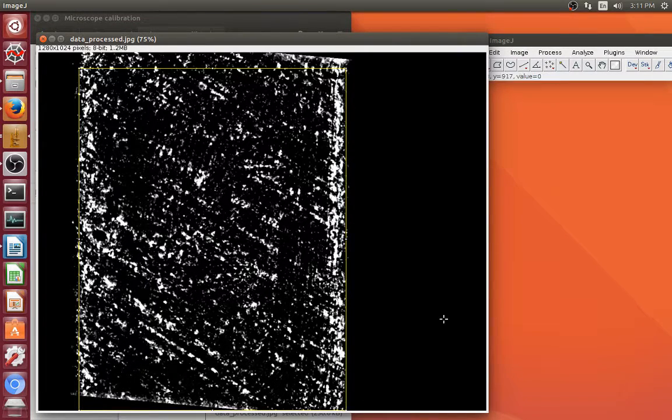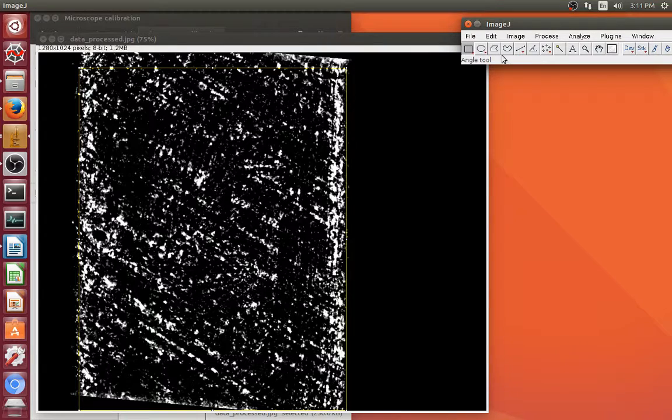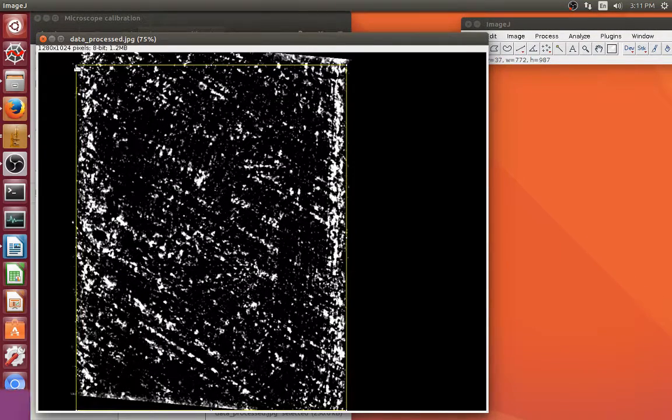So it says right up here that it measures 730 something. Where is that? Okay, there we go. Here, it reports the width. Okay, what is that? That's my edge, 771 pixels.